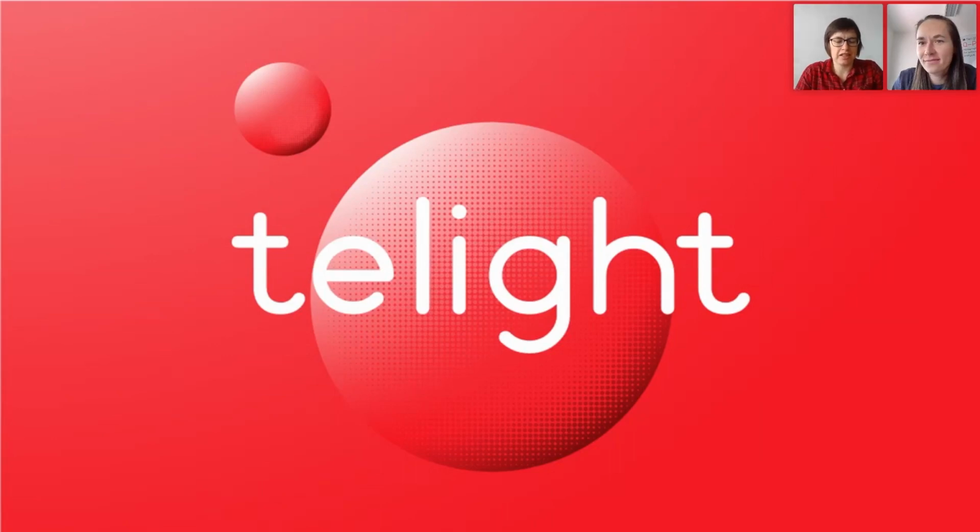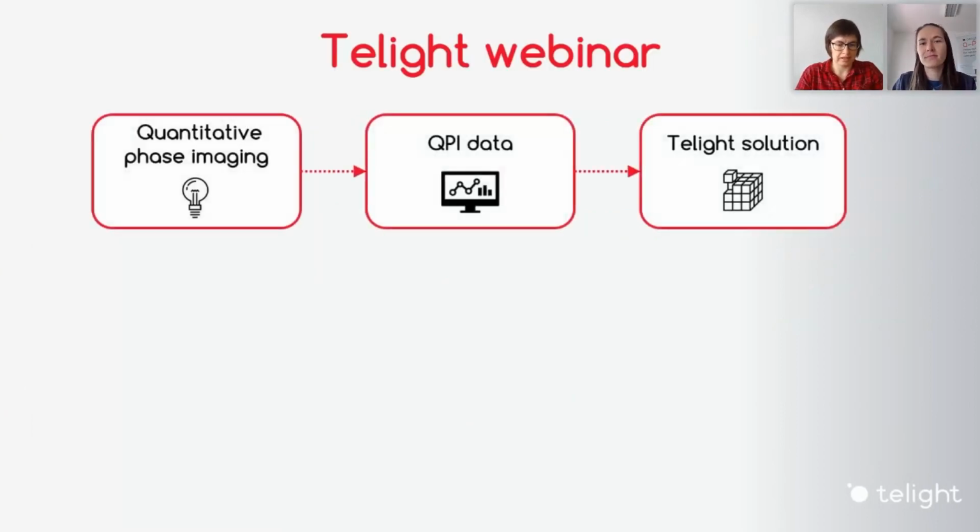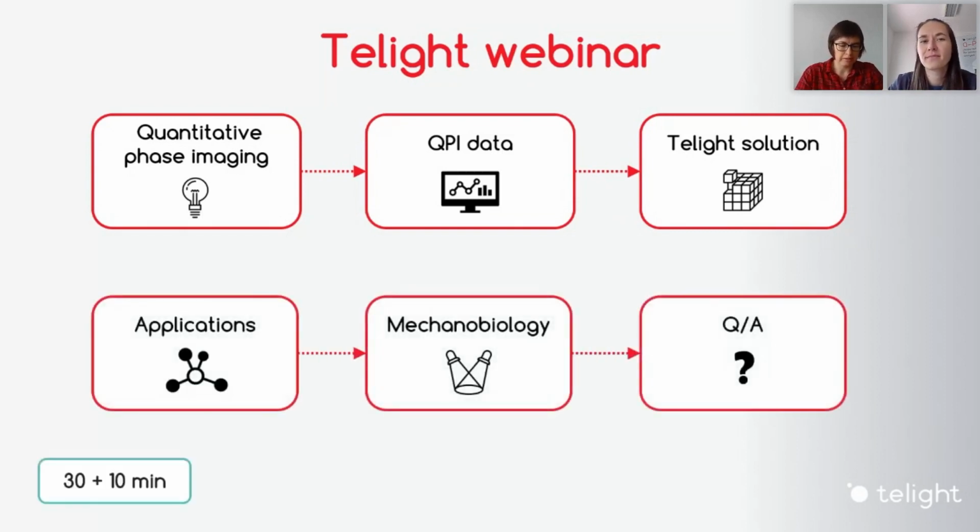My name is Aneta Křížová, and it's my great pleasure to welcome you to our webinar about quantitative phase imaging for live cell analysis. In our webinar, first, the principle of QPI will be explained, and then we will look closely at the data that can be extracted from quantitative phase imaging. Next, we will introduce to you our Telight patented solution for QPI and our analytical software. Finally, we will show you some possible applications of QPI in cell analysis with special focus on mechanobiology studies. At the end, we will look at your questions in the chat and discuss them.